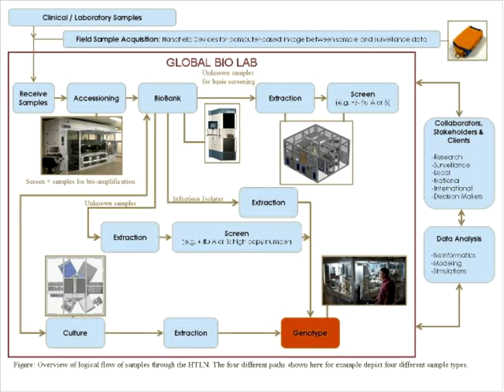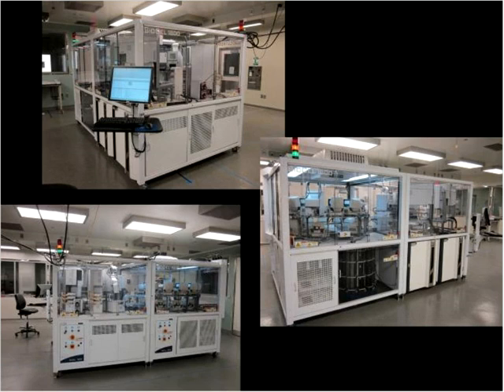The next system that I wanted to show you is the GenoPrep system, which again is also here already at UCLA, and we're in the process of going through the final validation of. This system is a system that once you have samples that have already had the RNA or DNA extracted, allows us to do the PCR amplification that's required for Sanger sequencing and preps the samples so that they're all ready to go into Sanger sequencers, which are located within the facility.